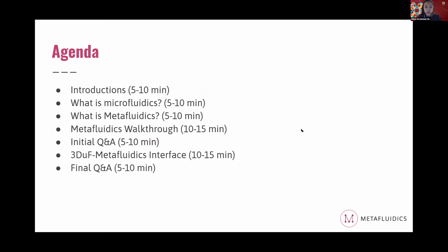I will start off by just briefly discussing our agenda for today. We're going to start with a quick introduction section. I think there aren't too many people in this call, so we will probably have time to go through everyone, just a quick self-intro, and then we'll go into a discussion on what is microfluidics for those of you who may be unfamiliar with this concept. And then we'll talk about what is Metafluidics, which is the repository that we're introducing.